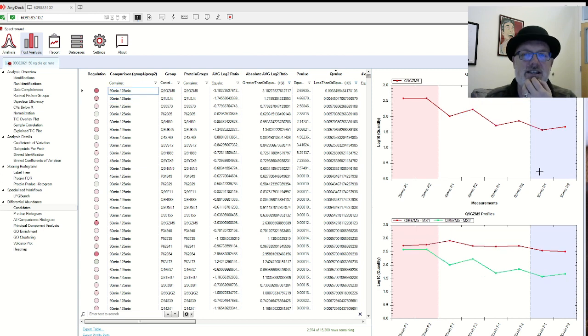And we can find opposites too. So let me explain this. There's two graphs we see here. The red one at the bottom is the MS signal. That's the signal on the precursor. The green bar is the signal we get from the fragments from the precursor. And you can see how the green bar is always below the red. And that's just a mass spectrometry thing. The precursors are always going to have a higher intensity than the fragments.